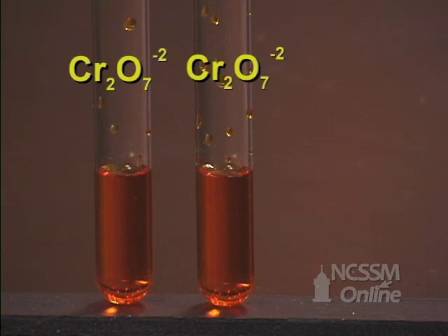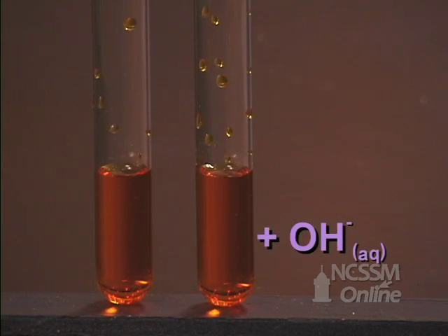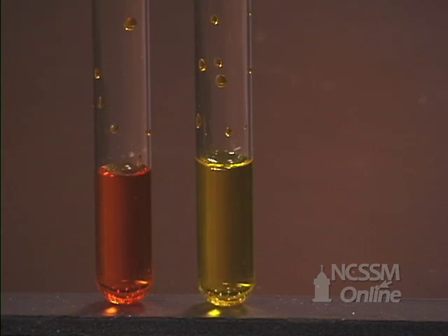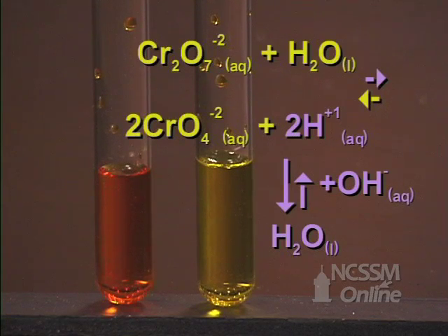We have two test tubes containing a solution of potassium dichromate. We will add some 6 molar sodium hydroxide to one of the tubes. We notice that the solution turns yellow, which indicates that the equilibrium has shifted from the dichromate to the chromate. The sodium hydroxide removes hydrogen ion from the solution, causing the reaction to shift in the forward direction.